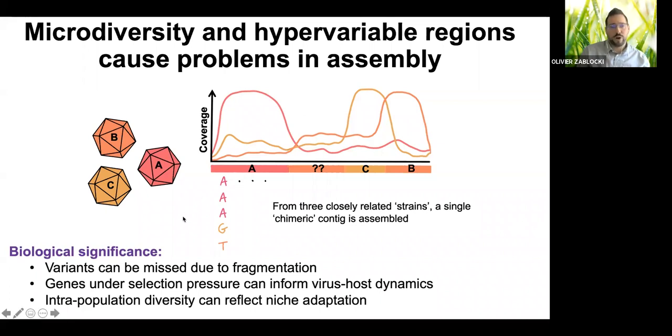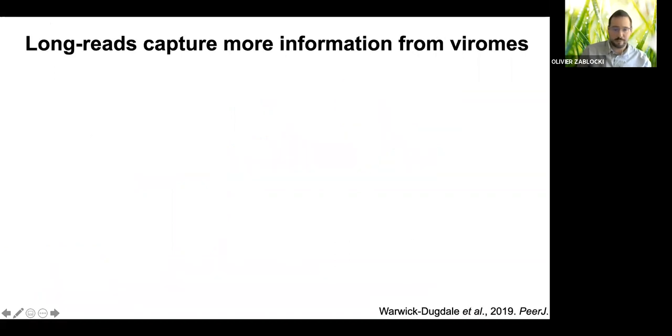And so what you would have here, for instance, is if you have 3 variants of the same population, and you have in your sample variants A, B, and C, if variant A has the highest coverage in the sample, it will choose A, and so on with the others, if you have the highest coverage for variant C here.